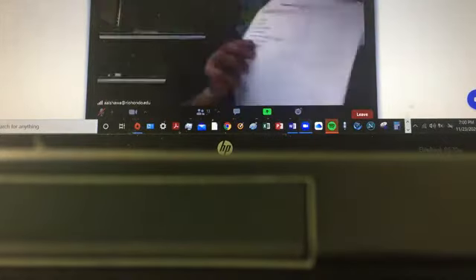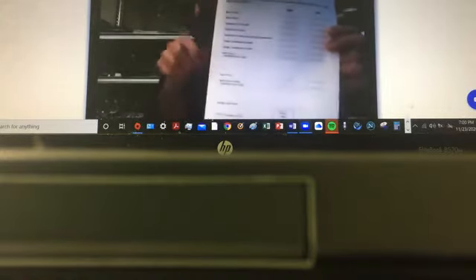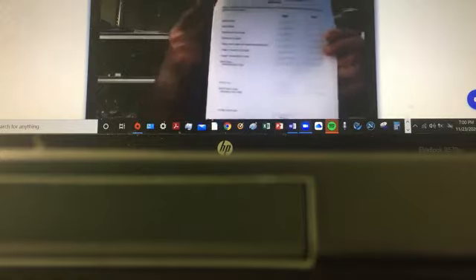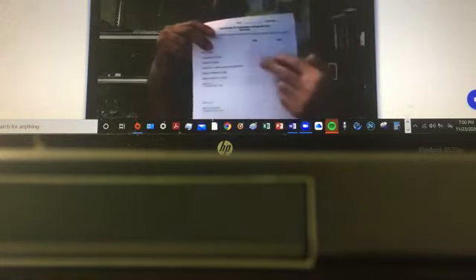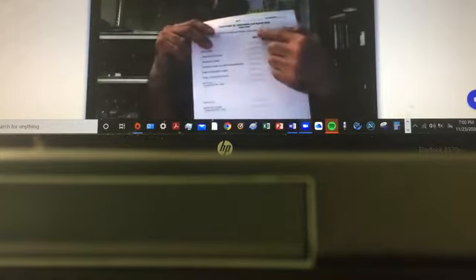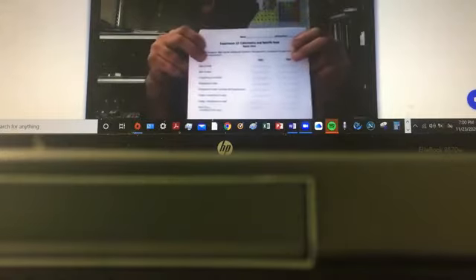Once again, just turn in the lab manual to page 99 or 100. Either one of these copies will show this sheet. That's your report sheet. There are two trials to be done, but I only have a chance to do one trial, and I'll show how to do one trial.